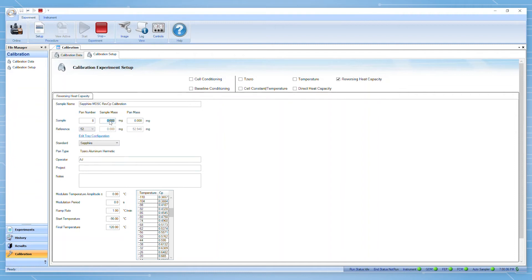Type in the sample mass of your standard and also the pan mass if you are running in T4P heat flow mode.